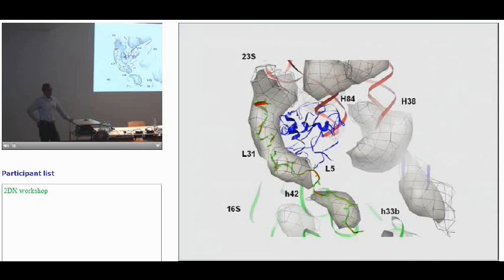Yes. Now, if you measure in X-ray, of course, you have your 10 to the 8th or so unit cells that contribute to your intensity measurement. So even though you only make a measurement at a point, this will be a very high quality measurement. So what I want to say is the sigma in X-ray is not more than the sigma that you plug in.